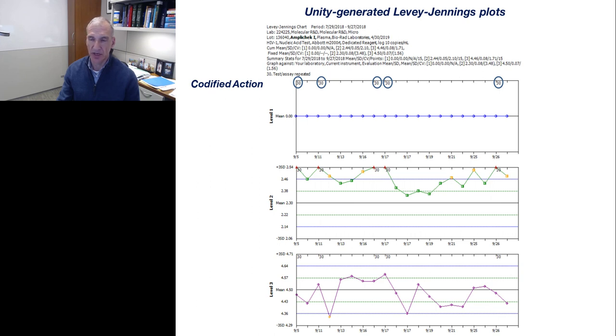And so this is an example of how you might, or you should, approach calculating means internally. So the package insert serves as a guide, but you can calculate the means using replicate testing yourself, and you should do that with each control.